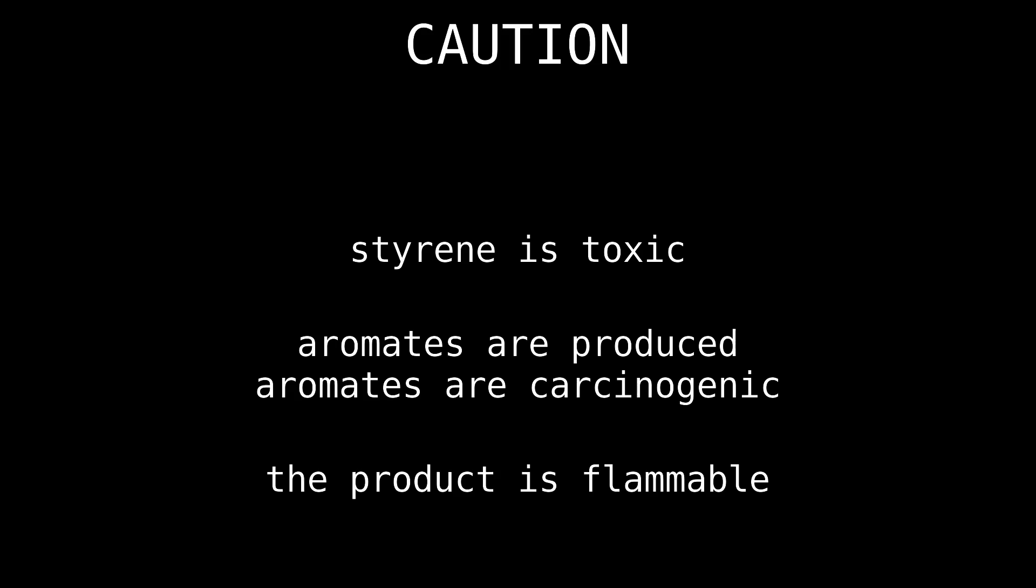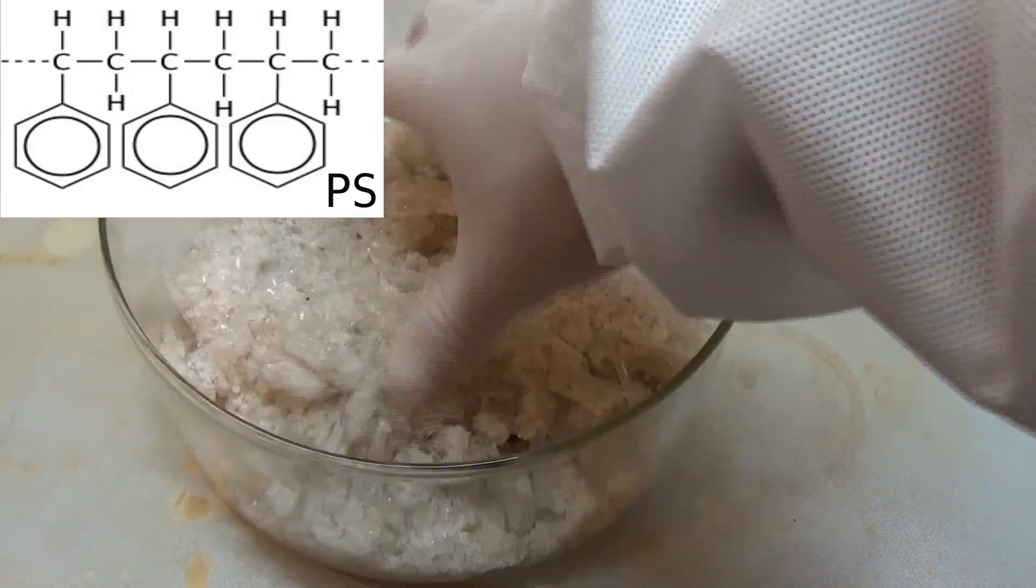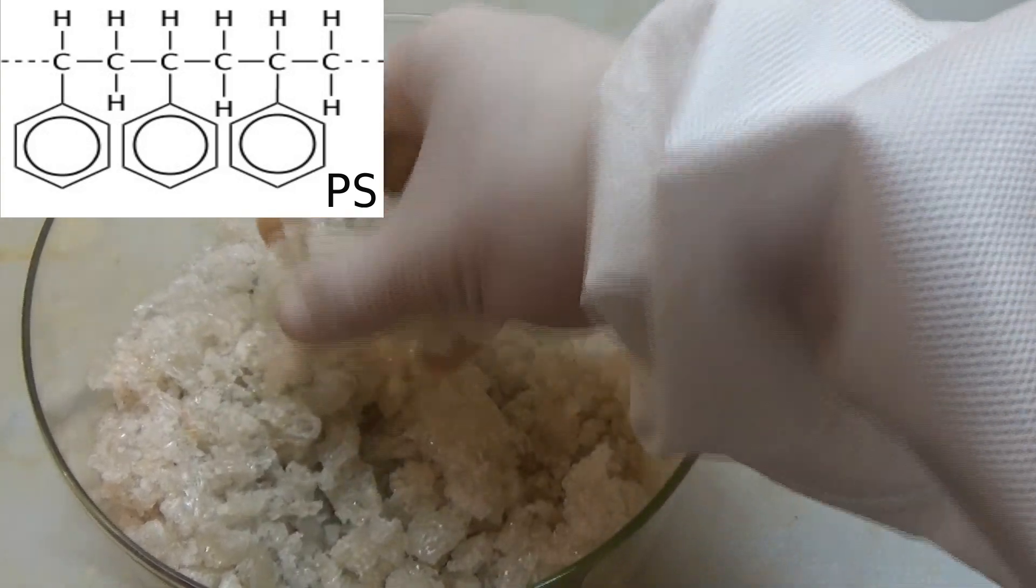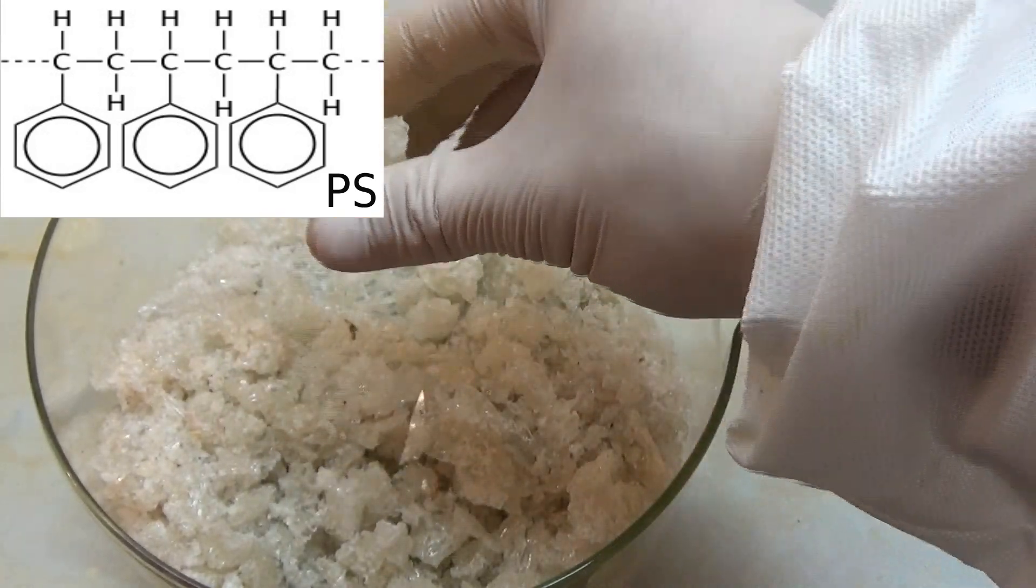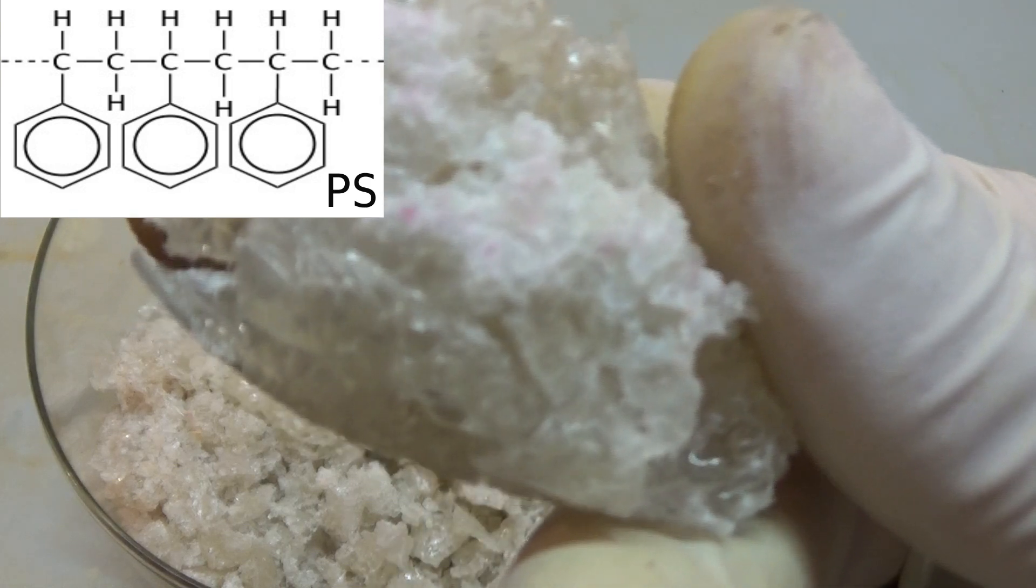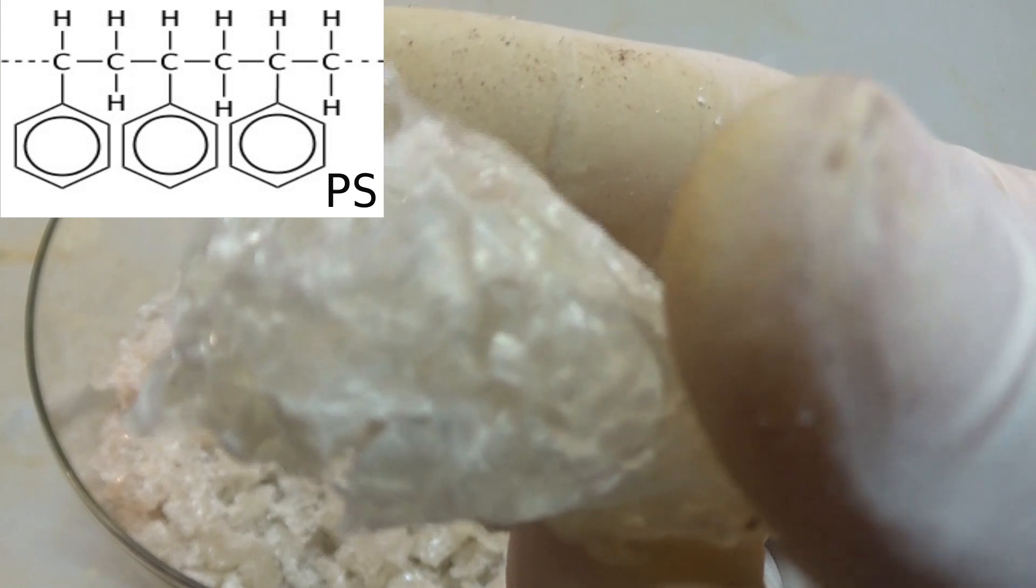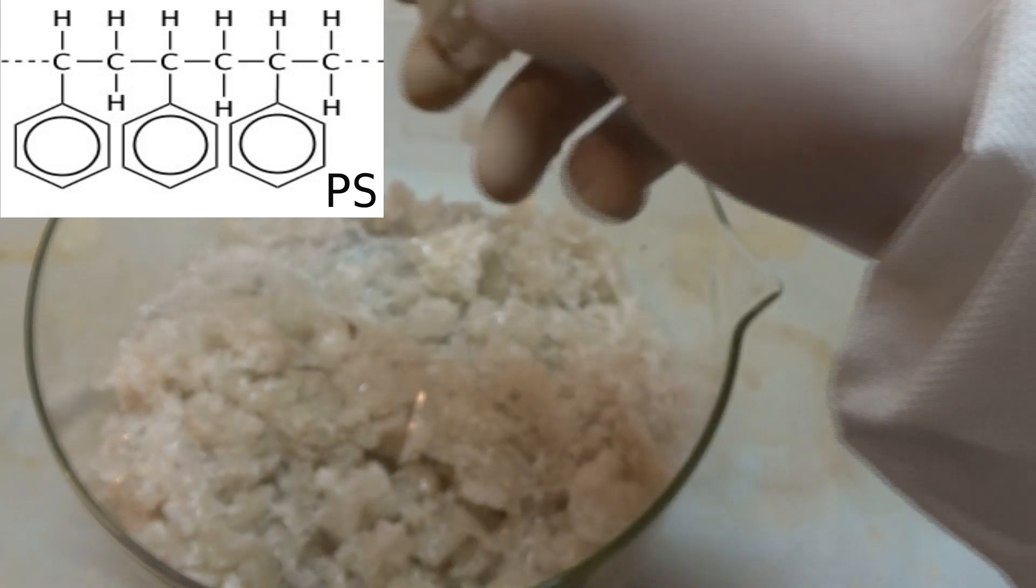Hello you all, in this video we will recycle polystyrene back into its monomer styrene. But be careful, the thermolysis process produces carcinogenic side products. This said, let's start by dissolving a lot of polystyrene into acetone and then evaporating it. I greatly reduced the volume and increased the density by a lot. This polystyrene granulate was way better to handle and reduces the time for producing a set amount of raw styrene by a significant factor.